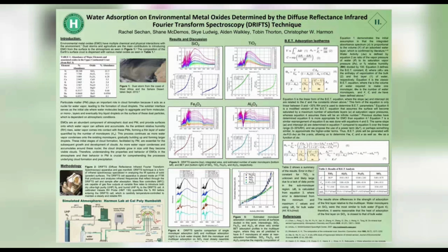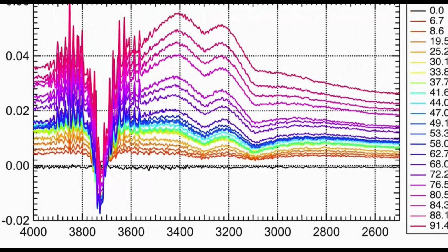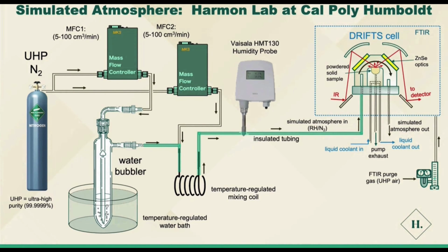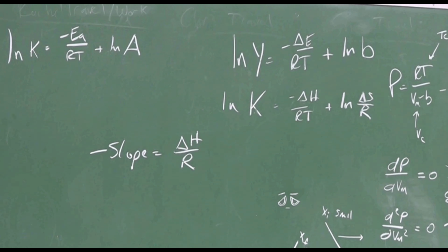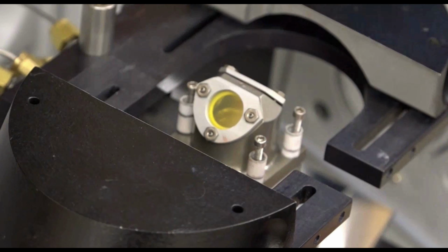Doing these studies requires a lot of organization. I have 5 students working for me right now, and when we go to start an experiment, it takes in excess of 36 to 48 hours, and we have to run the experiment continuously. We will schedule ourselves from 7 a.m. to 7 p.m., and the students will come in. They might have a half an hour break in between classes, or they can do a couple measurements and set things up for the next student. So I couldn't do this work without my team of students. It really is a team effort.